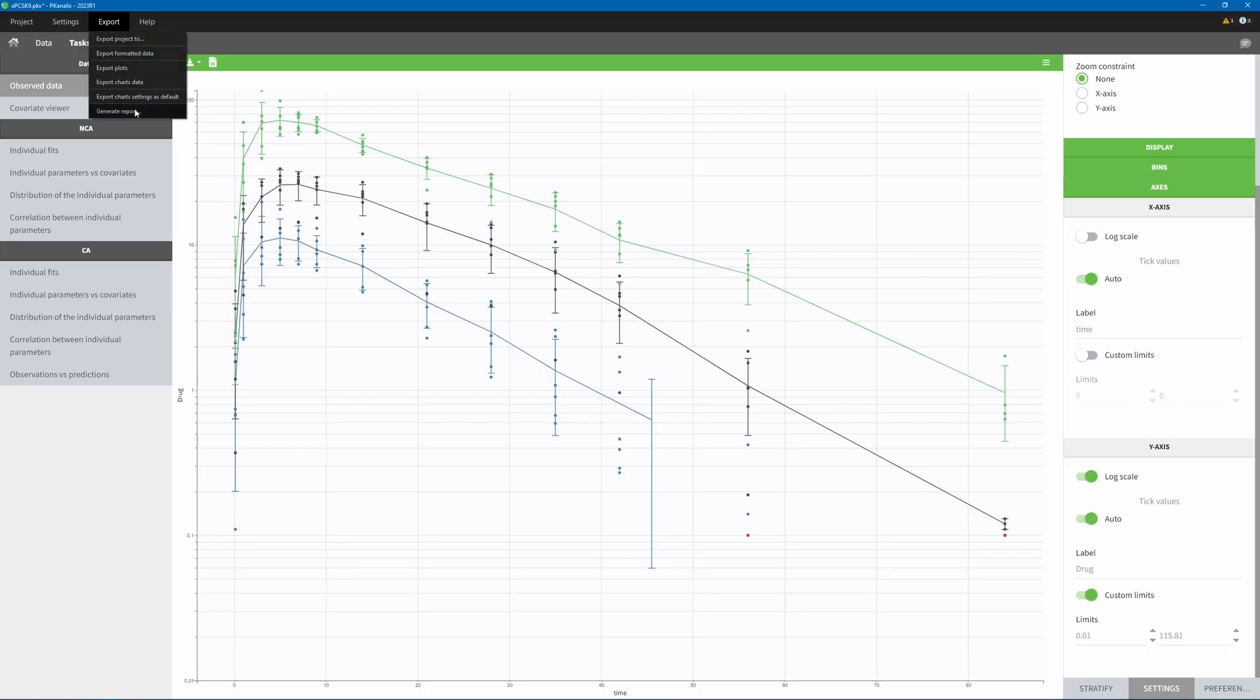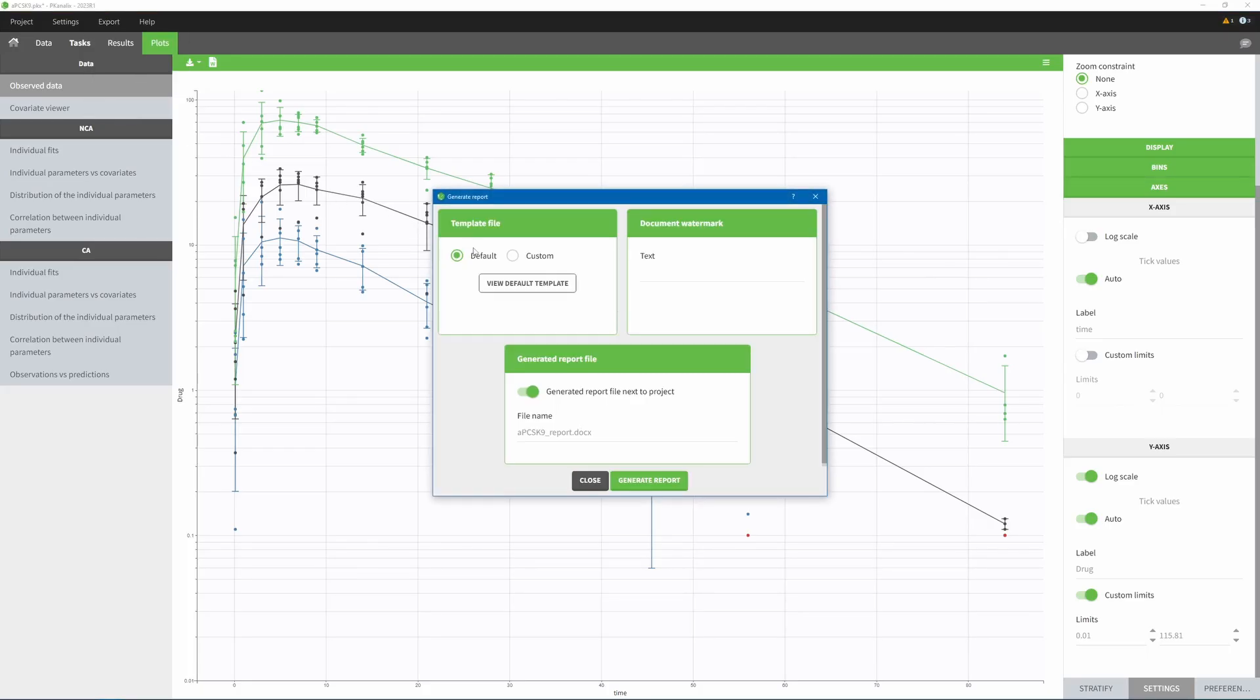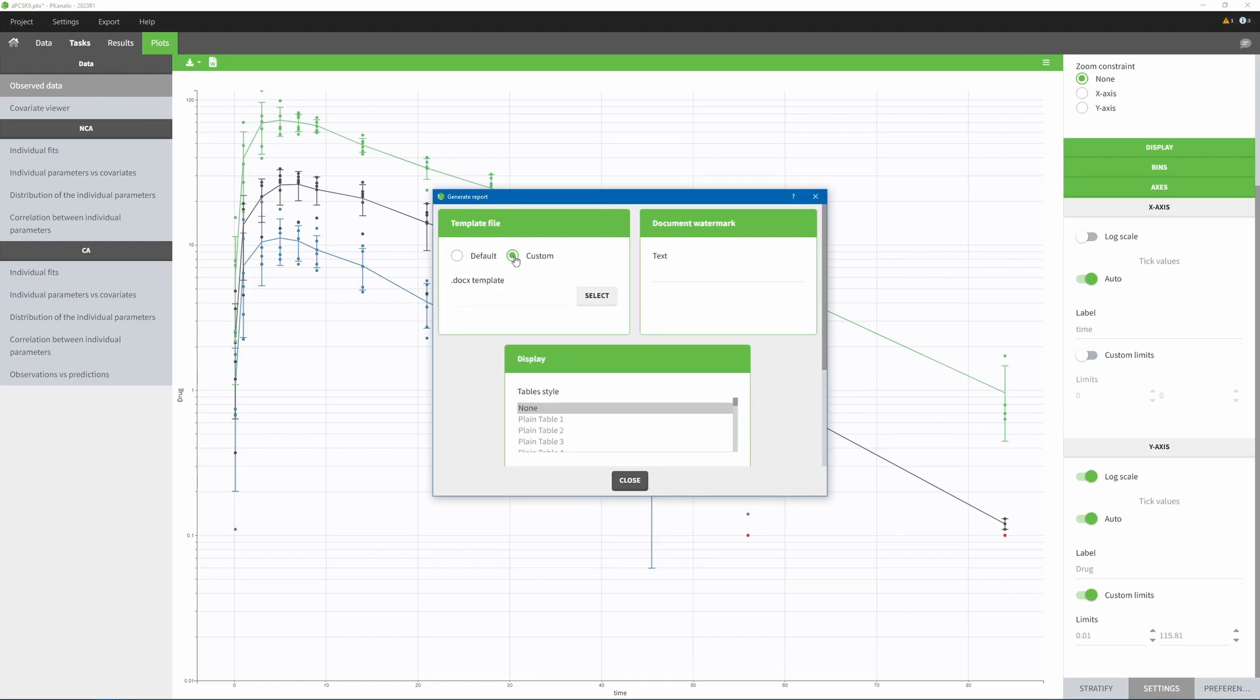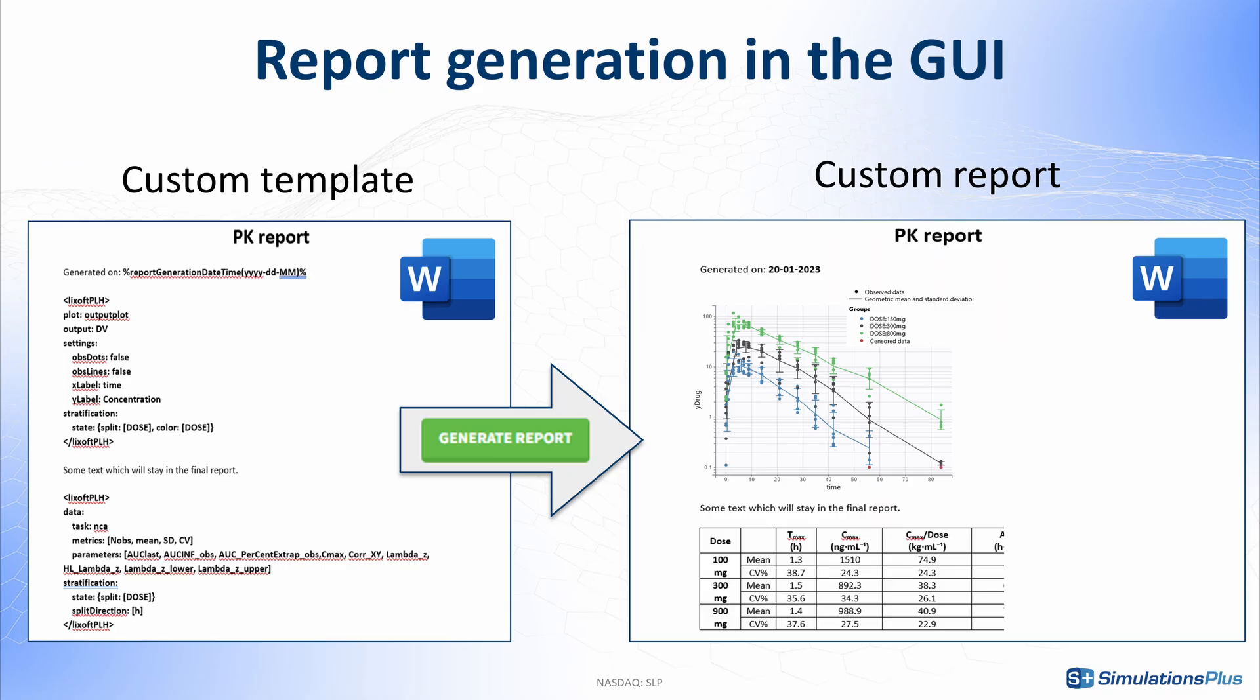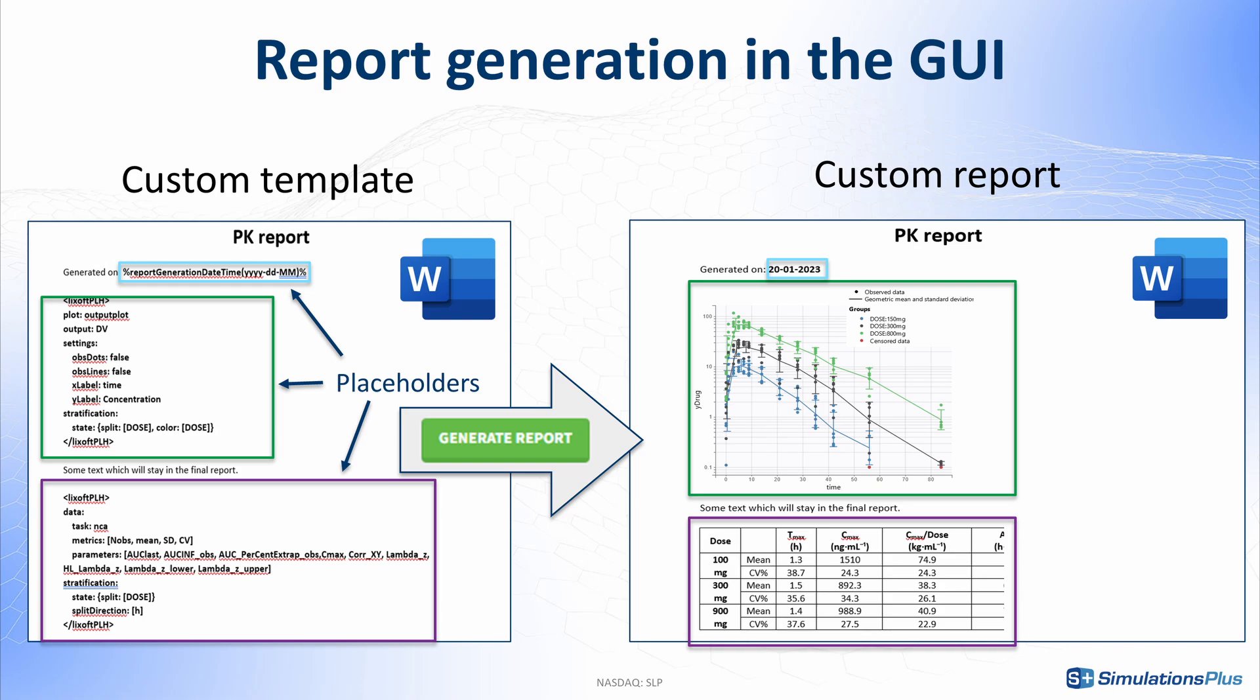To generate a custom report, you need to load a custom report template as a Word document that contains any text you want, as well as descriptions of tables and plots. We call these descriptions placeholders, because PK Analytics can automatically replace them by the corresponding tables or figures to produce your final report.